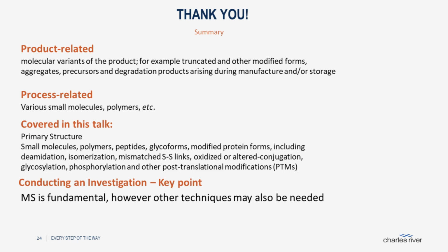What we do at Charles River is that at the end of every run sequence, we have an HPLC cleaning procedure. It's designed to keep the columns clean for one, but also just to switch over the instrument from one analyst to the next. So generally, that's going to involve different mobile phases. So removing the mobile phases that you did use and then replacing them with fully aqueous and/or isopropanol, those two solutions, and running those through the instrument, possibly through the column.